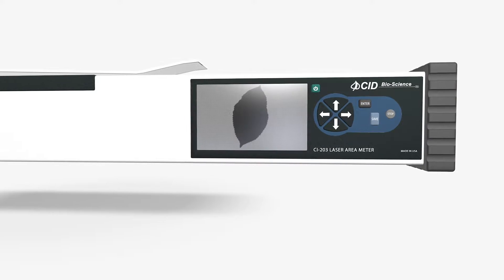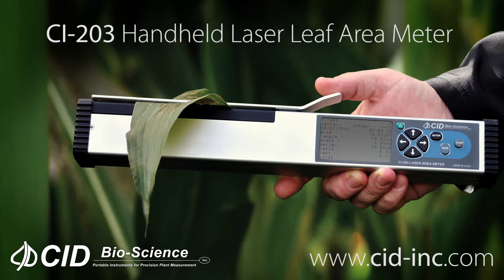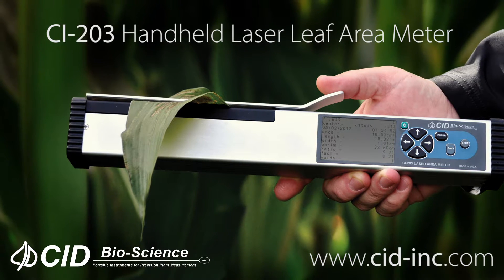The CI-203 has been used in a variety of applications for decades and has been a vital tool in the study of leaf measurements and hundreds of examples of published research. Find out more about the CI-203 handheld laser leaf area meter and other tools for taking non-destructive measurements of plants at cib-inc.com.